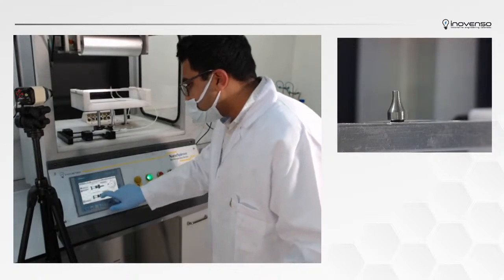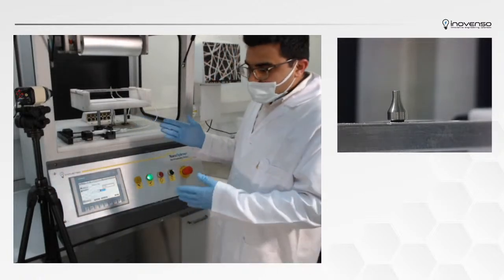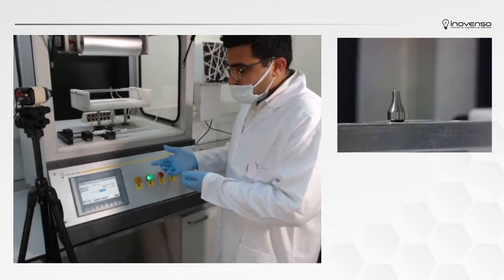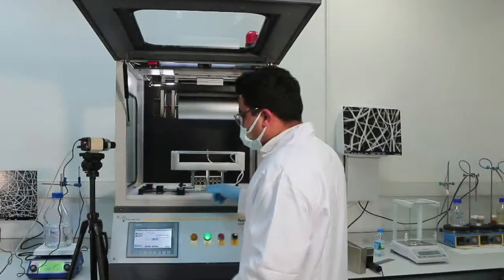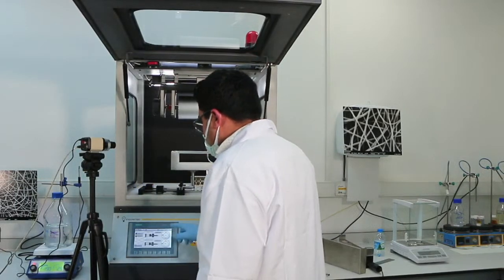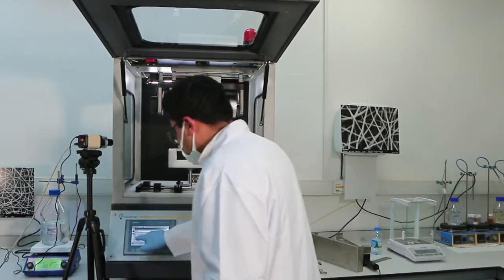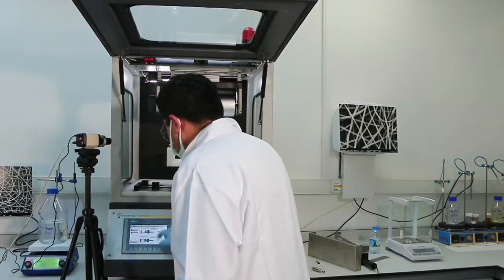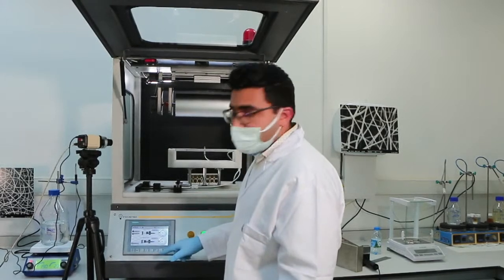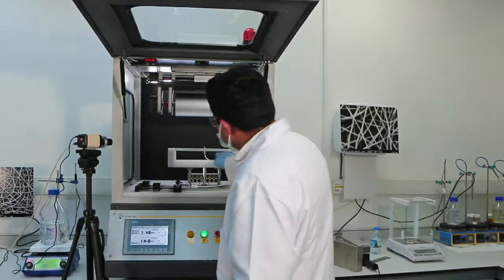All right, now we have to put in the syringe pump. What type of syringe pump? You can use various kinds of syringe pumps in our machine, but you have to set them accordingly. We're using a local brand, so I'm going to press set 10 here. Also, you need to put in how much solution volume you have. I put 10, so it's completely full. Now I'm setting the flow rate to 5 milliliters per hour. But before that, I would like to purge the solution all the way from here to the tip.